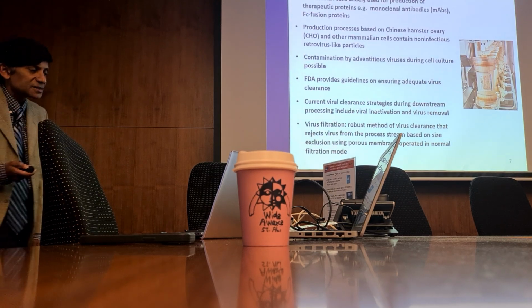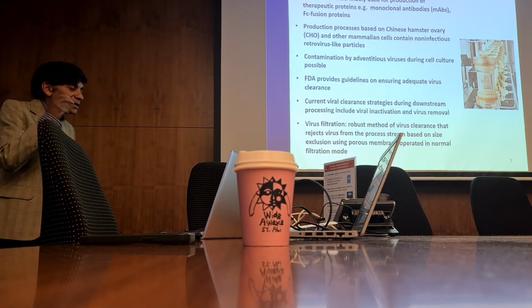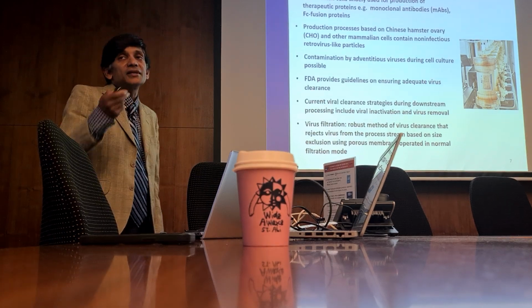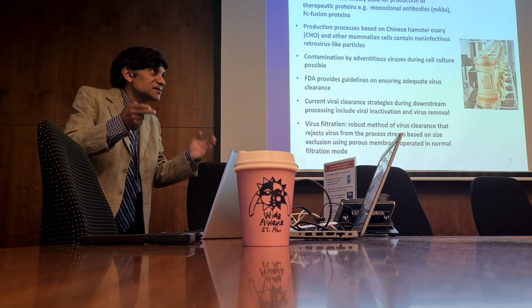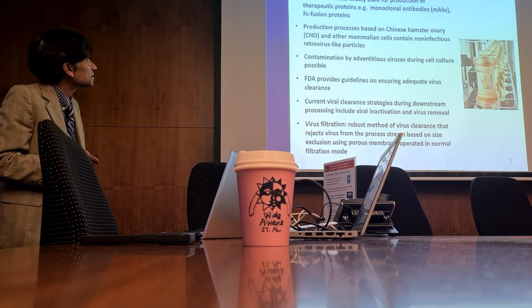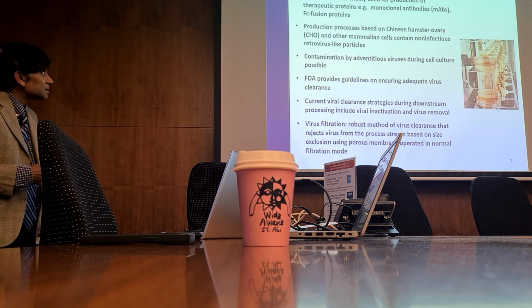The other point is that the biotech industry is highly regulated, right? To make any change, you're going to have to get approval again from a regulatory agency, FDA or something else. This is very costly and expensive. So the main focus in industry is to take existing unit operations and ask, can you improve their performance? That's really what the focus is. So as I said, we're using mammalian cells. We use them to produce monoclonal antibodies. Chinese hamster ovary cells are typically used.